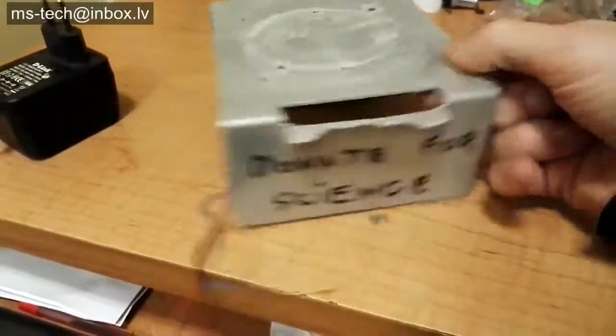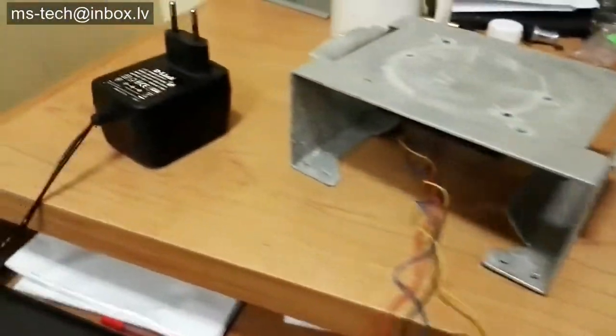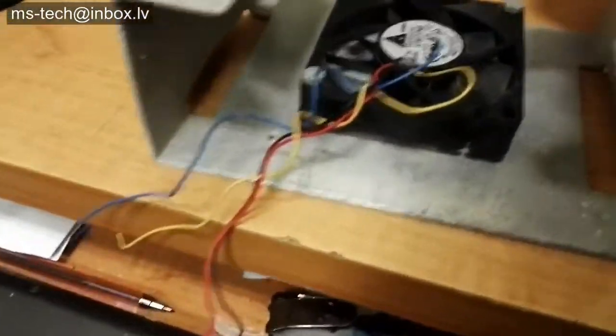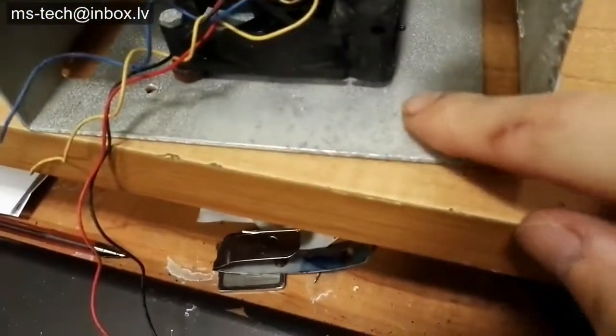I needed a magnetic stirrer to keep some cells agitated for cell culture, but didn't want to spend the hundreds of dollars needed to buy one. This magnetic stirrer uses an old computer fan and some cheap neodymium magnets with a moldable plastic stir bar.